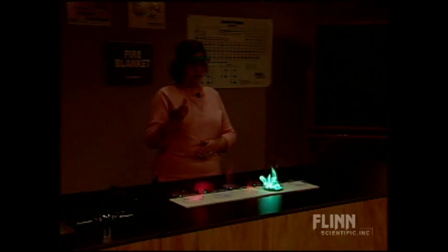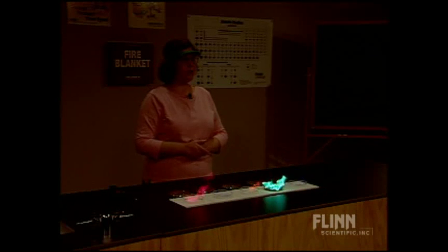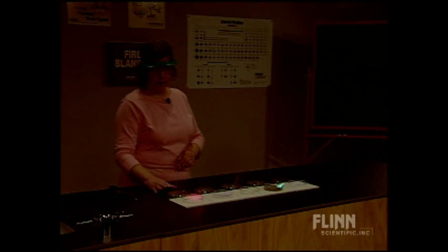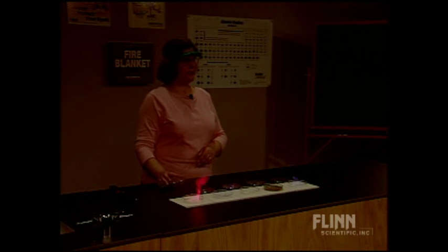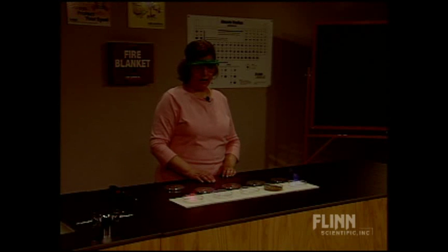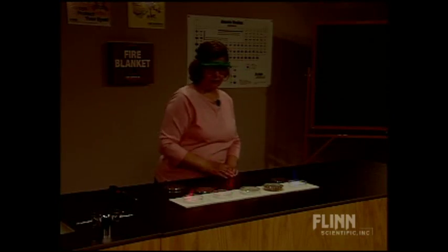What you can do is simply let them go until they've dissipated the methyl alcohol - it won't take that long, but you can't rush it at all. Once you have started this demonstration, that's it. You don't do anything else; let that methyl alcohol burn out. I do have the tops to these petri dishes, so if I wanted to extinguish them at the end, I could do that very simply by placing the cover on top of the petri dish. We've extinguished all of the flames.